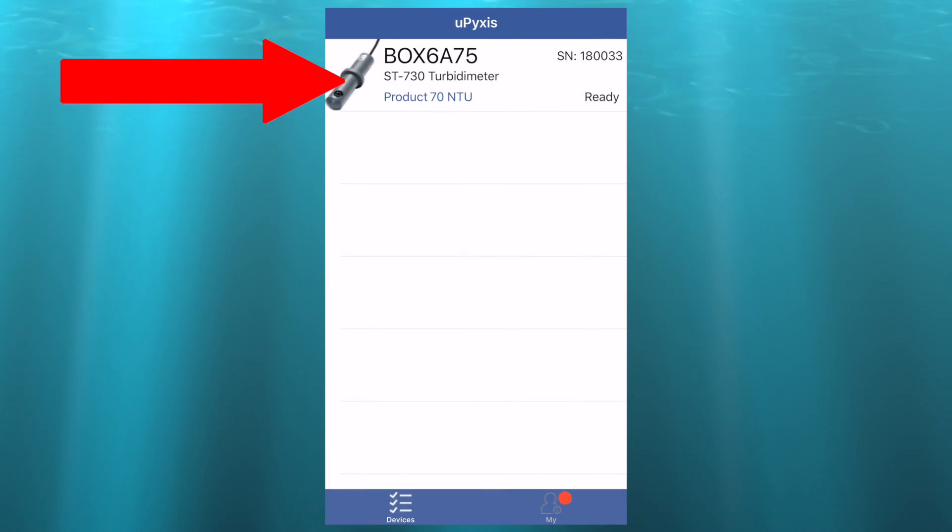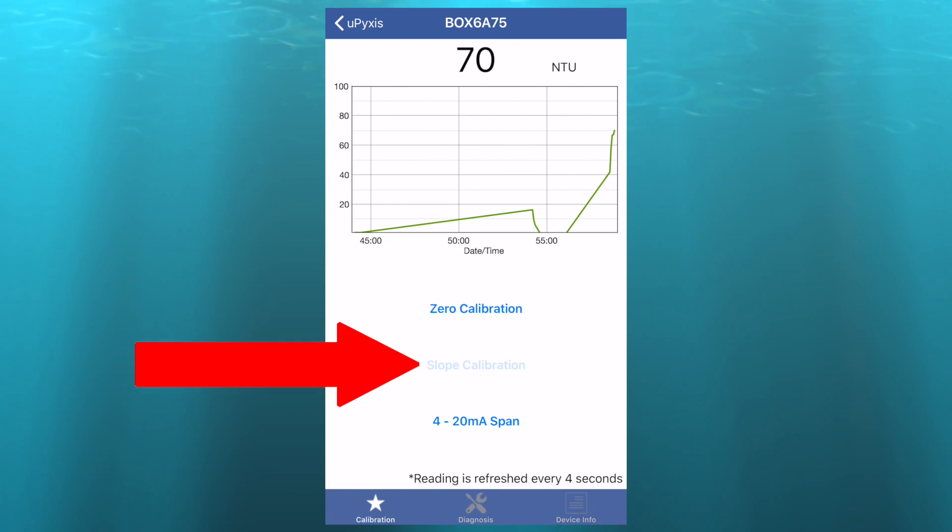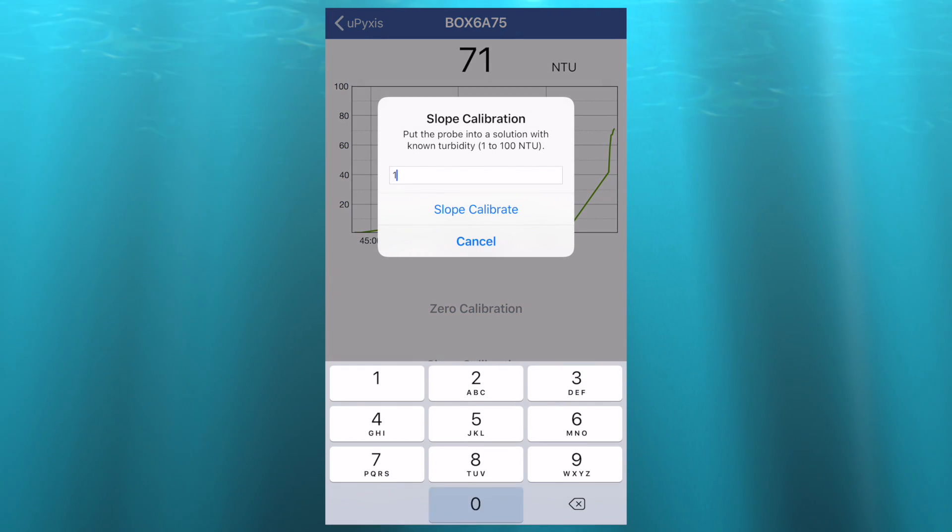Then, on the uPixis app, select the ST730 and then select Slope Calibration. Enter in 100 and select Slope Calibrate.